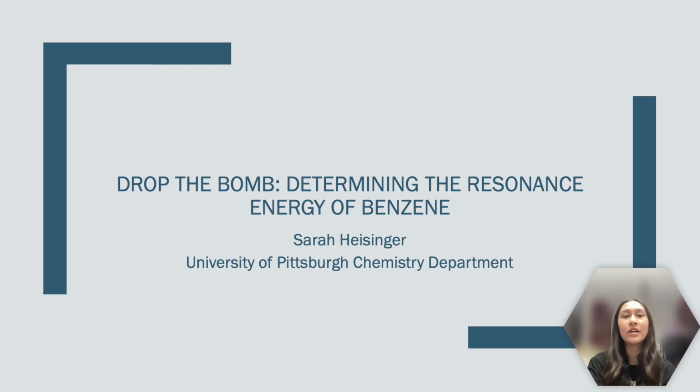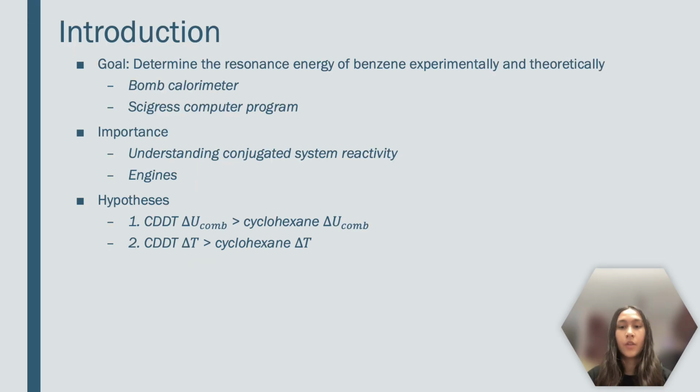Hello, I'm Sarah Heisinger with the University of Pittsburgh Chemistry Department, and today we're going to drop the bomb and determine the resonance energy of benzene.